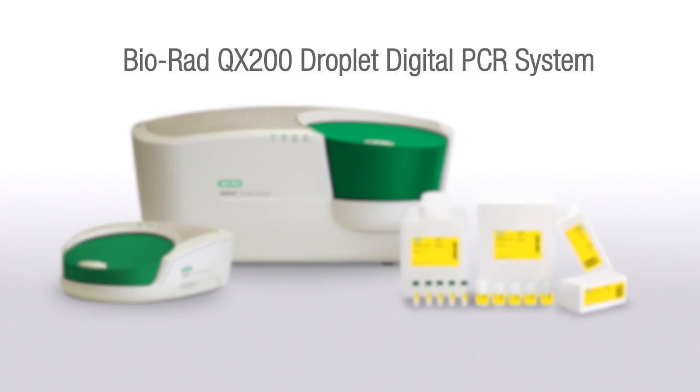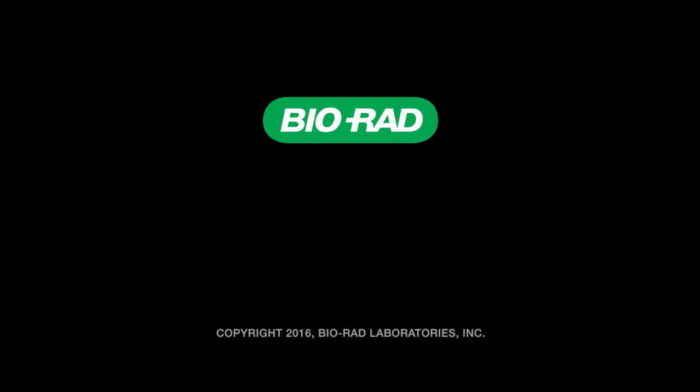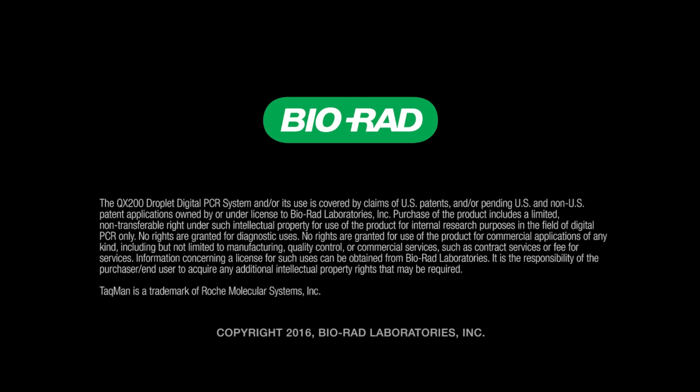QX200 Droplet Digital PCR, the future of quantitative PCR is here, and it's digital. Be part of it. For more information about the QX200 Droplet Digital PCR system, visit our website or contact us directly by phone or email.